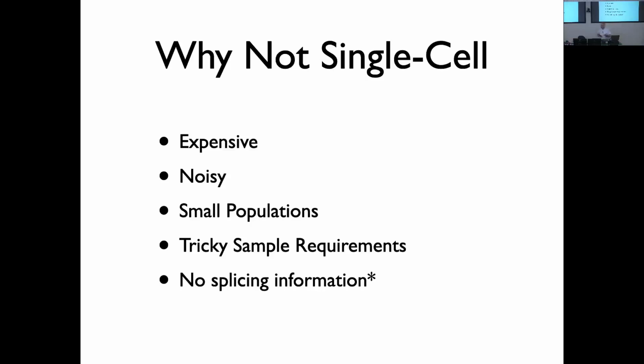The sample requirements for single-cell RNA-seq can be kind of tricky.